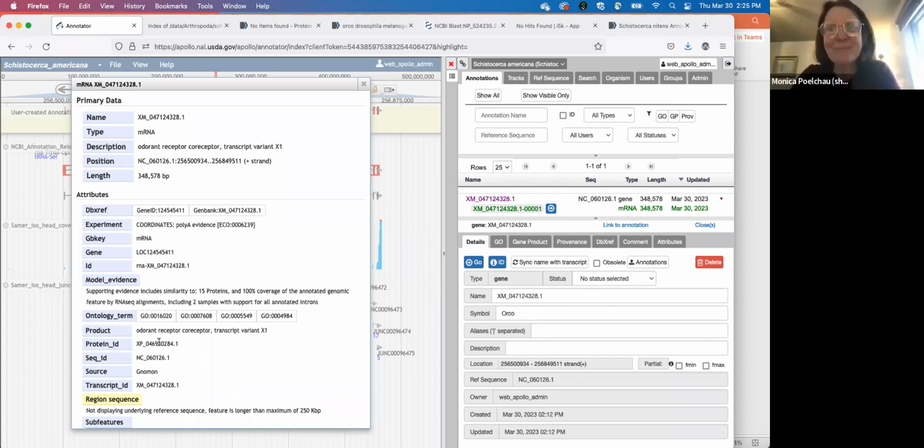Unfortunately. But one thing, David, and all of you too, I wanted to point out: we ran our functional annotation pipeline on all of the protein data sets here. I showed you the links to the flat files where you can essentially just see a GAF or Excel file that shows you, here's my XP number and here's the GO or KEGG number that was associated with that, and you can perform analyses on this.